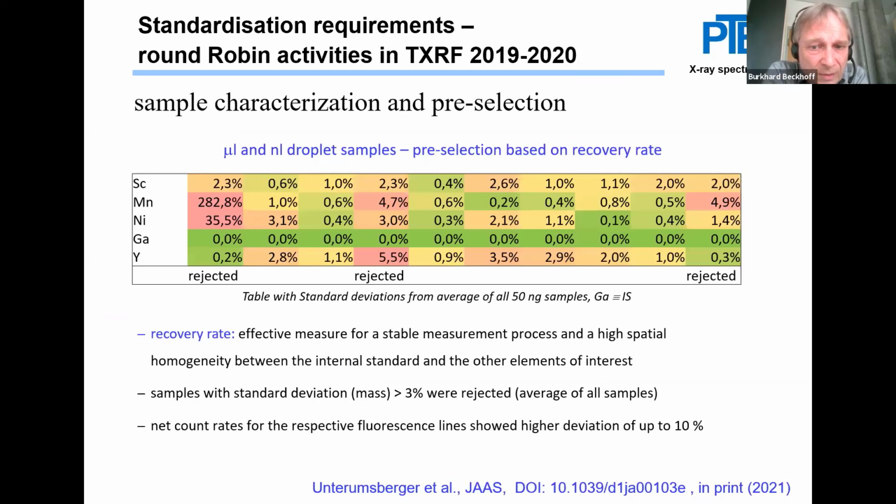So, for example, one concept was, and I'm glad that Hagen is here, who may correct me, a careful pre-selection of samples, so that different types of samples were checked regarding their recovery rates. Those with the highest recovery rates were selected, and then individual samples were once again pre-selected to achieve a high uniformity of the spatial distribution of the depositions.